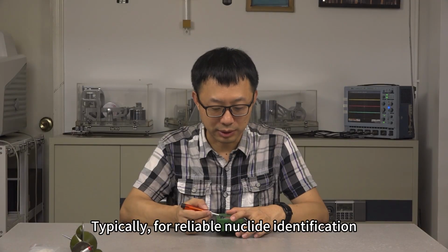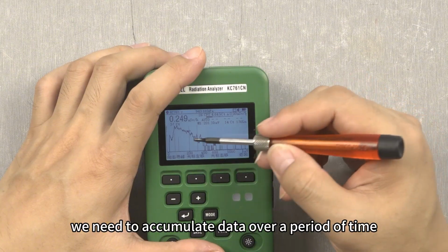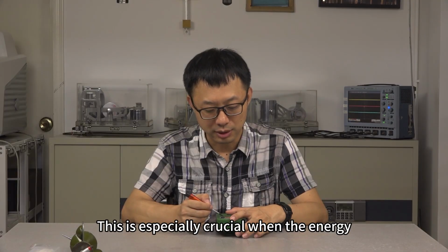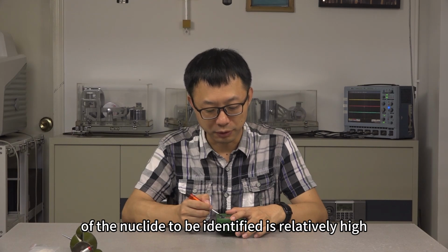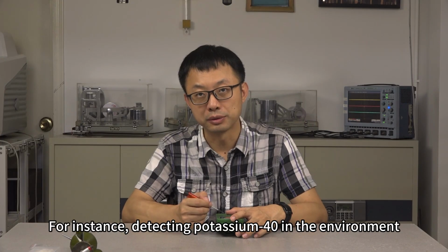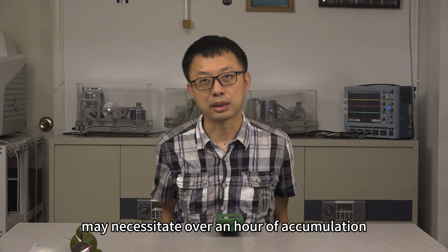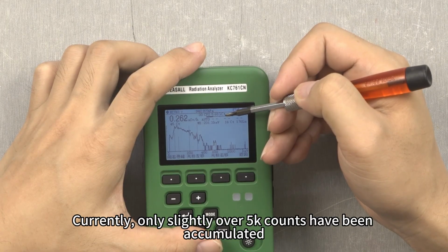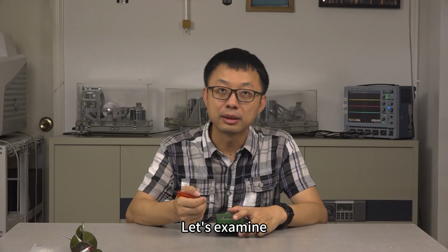Typically, for reliable nuclide identification, we need to accumulate data over a period of time to achieve a smoother curve. This is especially crucial when the energy of the nuclide to be identified is relatively high. Due to the lower sensitivity at high energies, longer accumulation times are required. For instance, detecting potassium-40 in the environment may necessitate over an hour of accumulation. Currently, only slightly over 5K counts have been accumulated. This accumulation is insufficient. Let's examine.